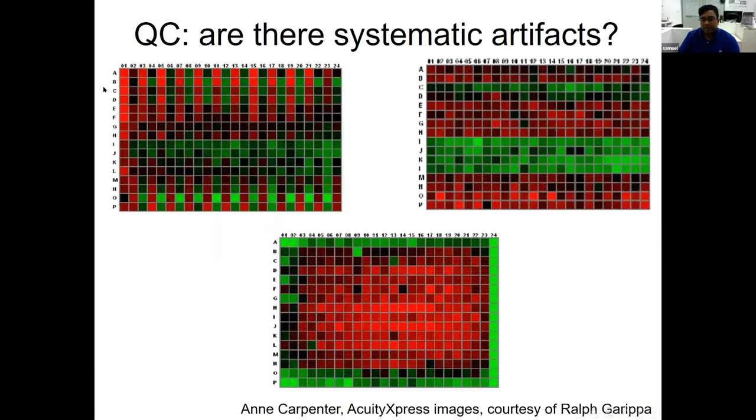In principle, you have a robotic machinery that puts in each of these the drug. You know which drug is put where. You find the wells that have the phenotypes that you are interested in, that shift the cells into the healthy state. And you know what well it is. And then you know what drug you put there. And then you start validating this drug and start this long process.